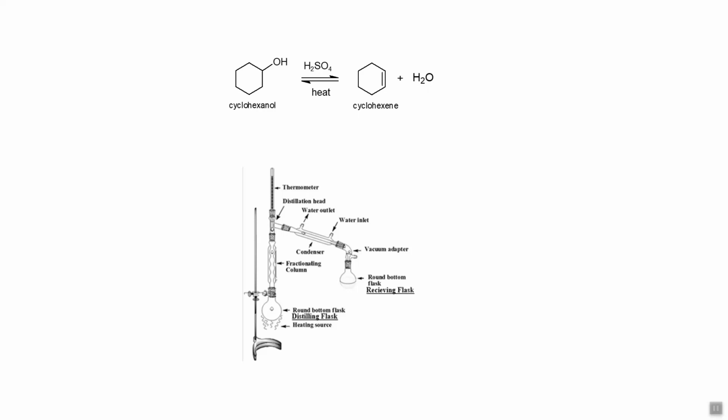I'm leaving you a little bit on your own here to distill what I said down into a good hypothesis. Remember that your hypothesis should not focus on the experimental details, but more on the general principles of, for example, why we're using distillation, how much product we're going to isolate, how Le Chatelier's principle plays a role, how sulfuric acid is a catalyst, and so on and so forth.